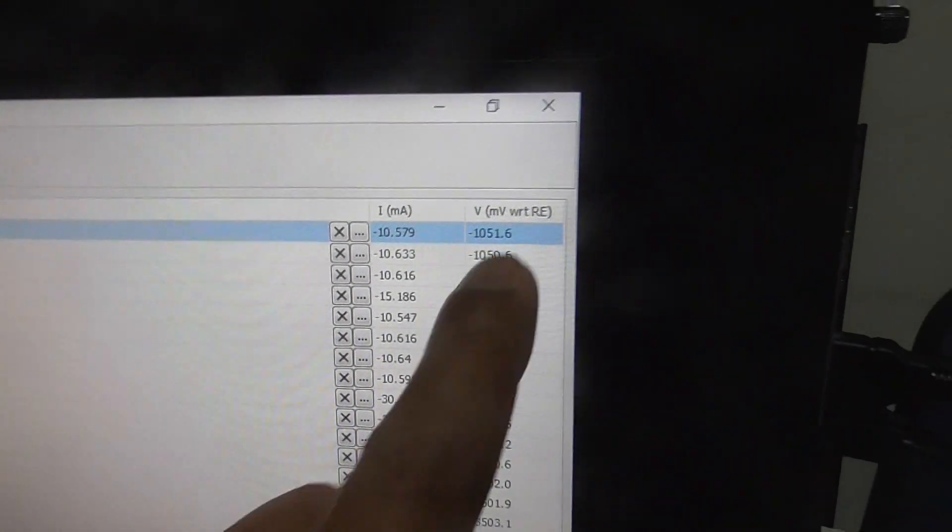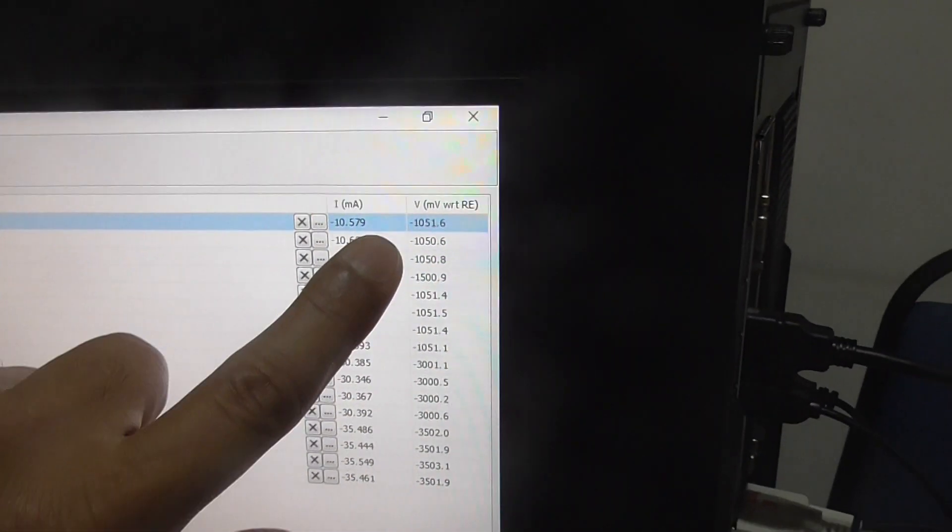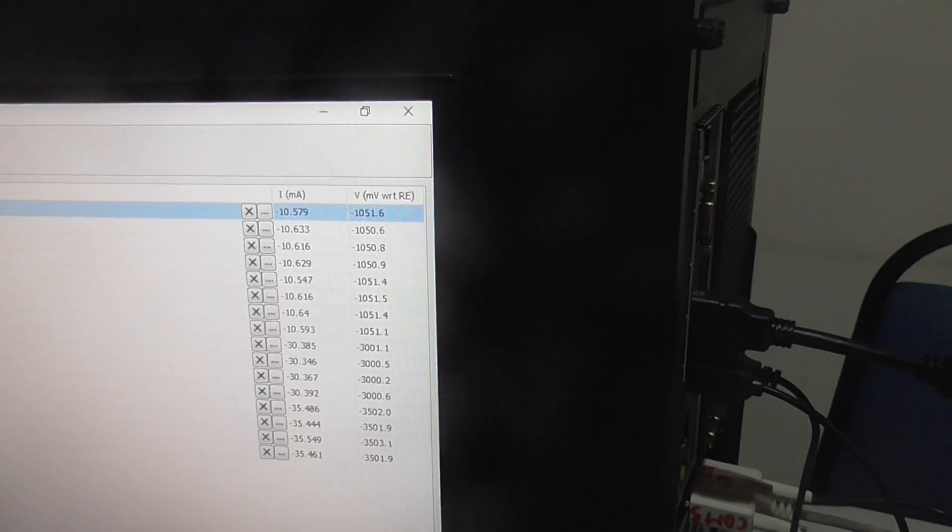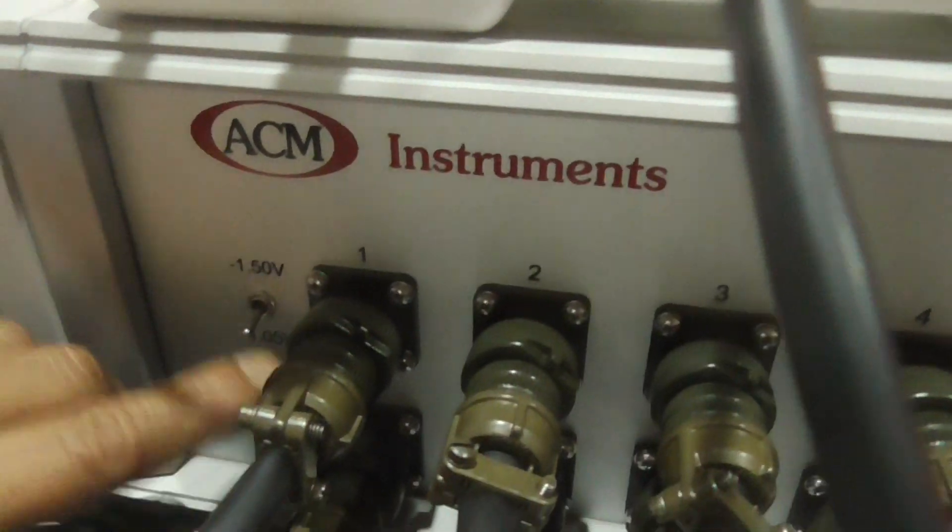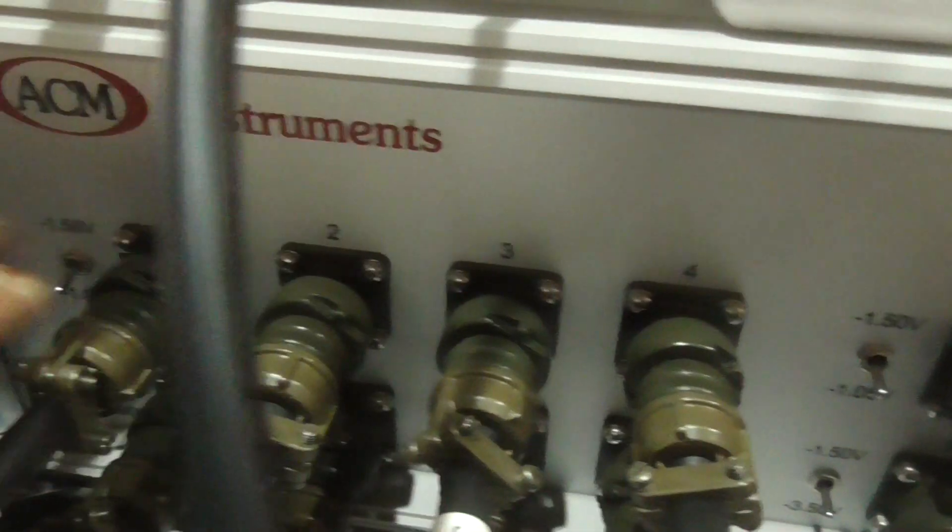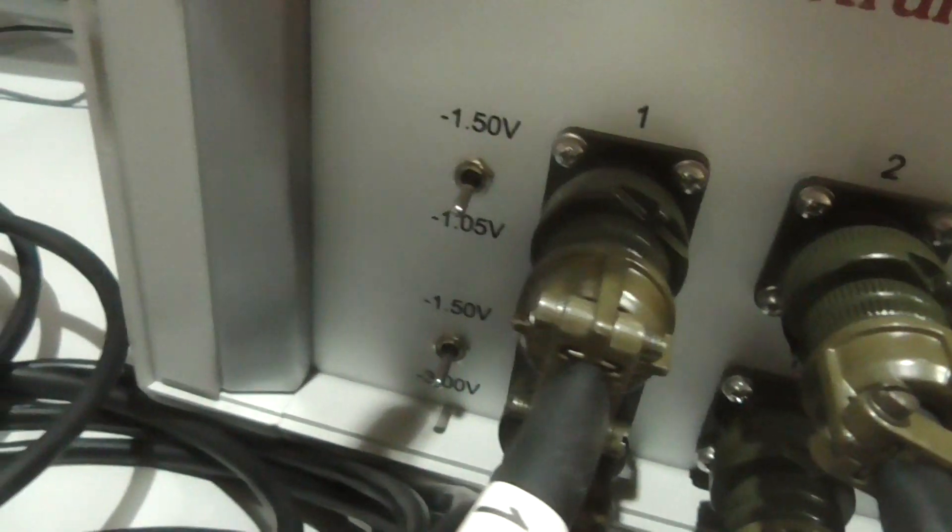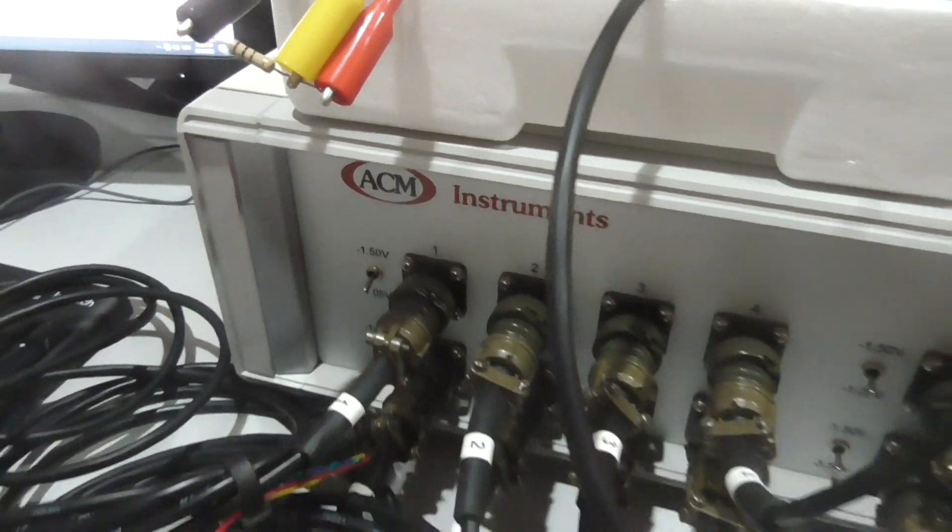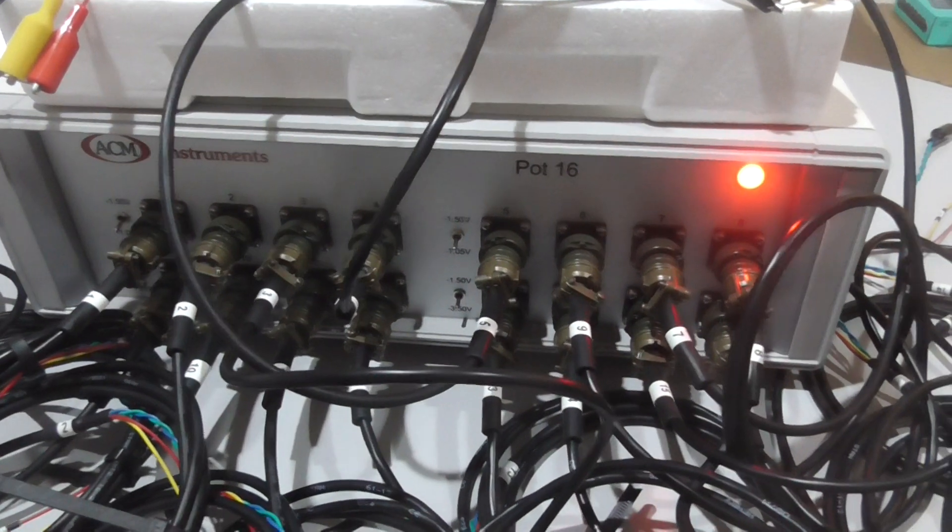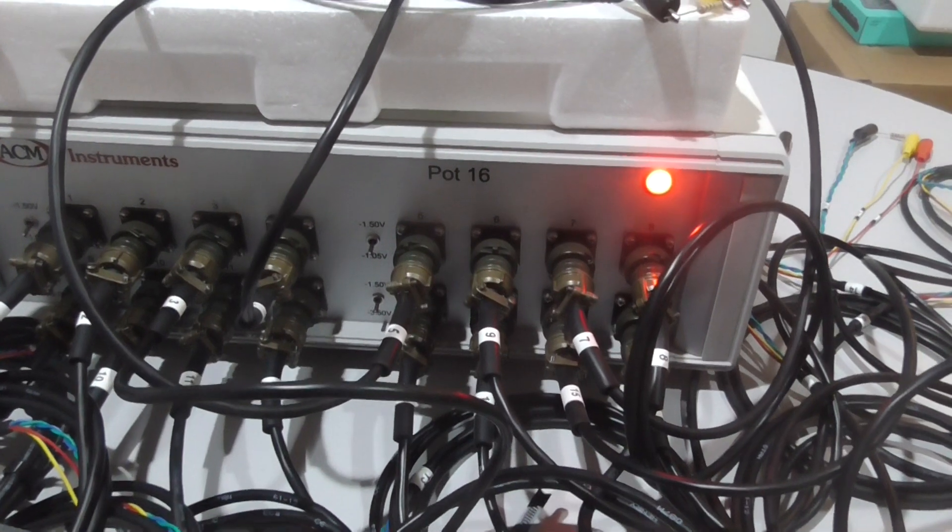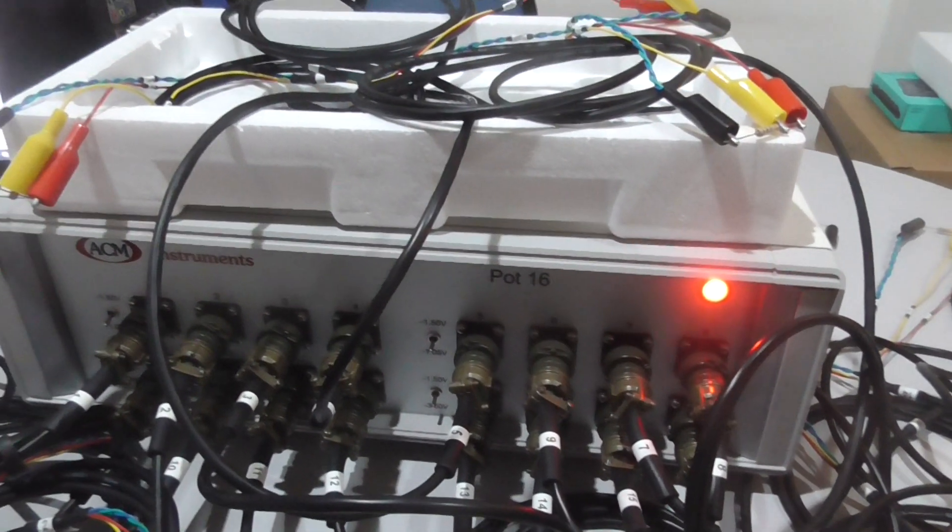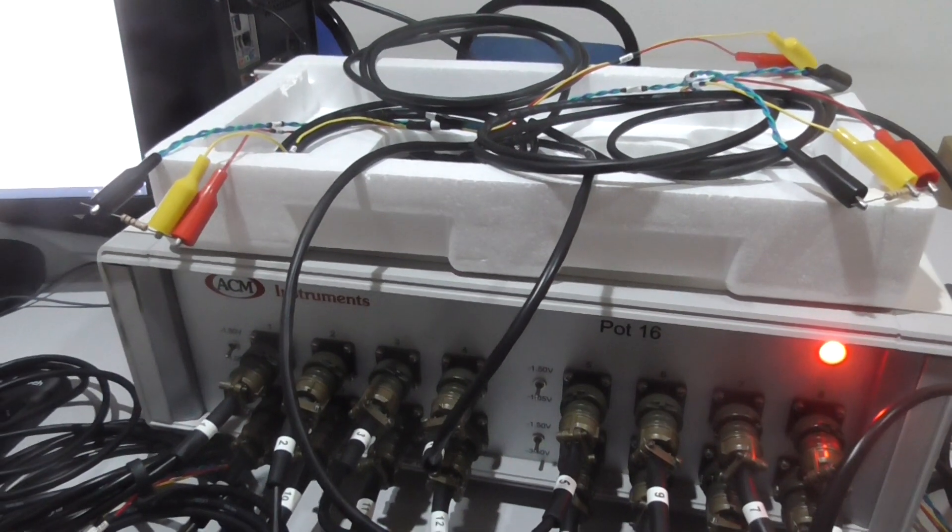Now it will show straight away the new measurement. All the 4 channel voltages are changed. So this is the best for the industry, easy to use.